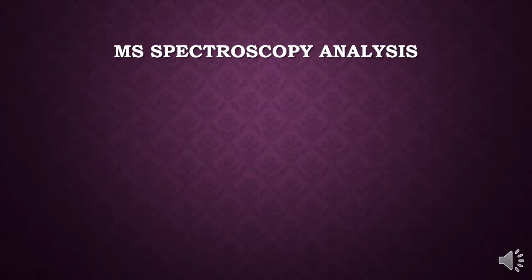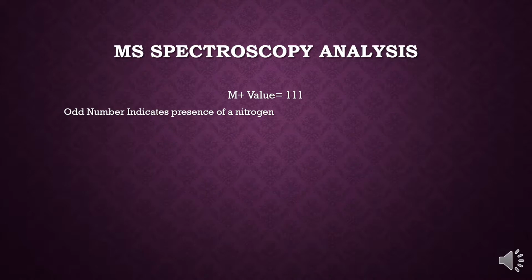You want to keep a few things in mind. First off, you need your M plus value, which we found to be 111. What's good about this is that since it's an odd number, there must be a nitrogen present. That odd number also tells us that there can't be any halogens. This is based off how many bonds nitrogen and halogens make. To start finding your formula, you want to subtract the molecular mass of one nitrogen from your structure's total molecular mass. So you take 111 minus the 14 and you get 97.